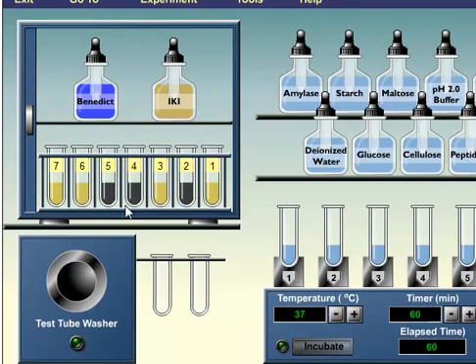These results indicate that tube number two, four, and five had starch. Tube number one, three, six, and seven had no starch. If you recall from earlier, in tube number one, six, and seven I did not add any starch. In tube number two, four, five I added starch.